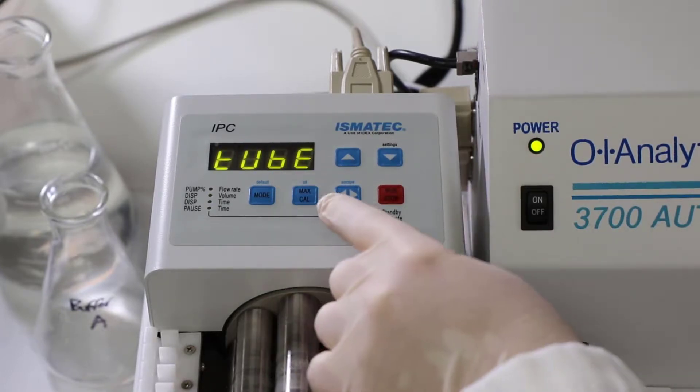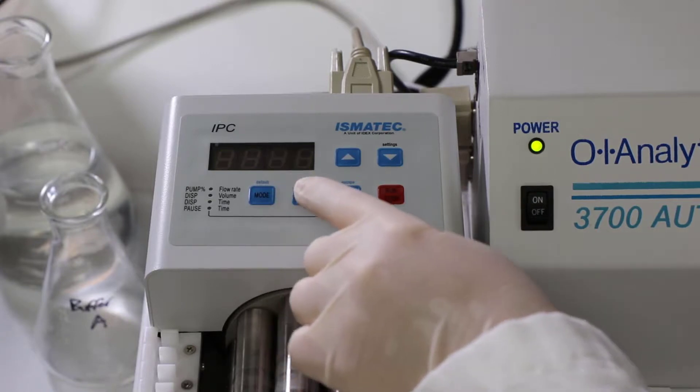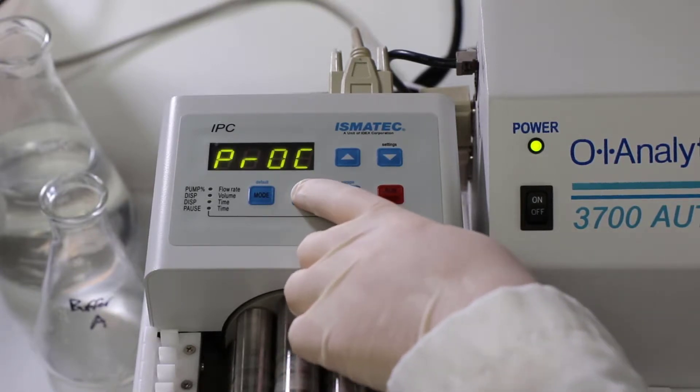When the word 'tube' appears, you're going to press OK, and then you'll see that the PROC is flashing, and then you're also going to hit OK for that.